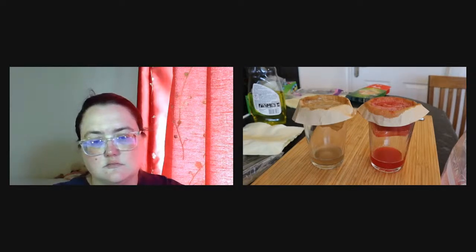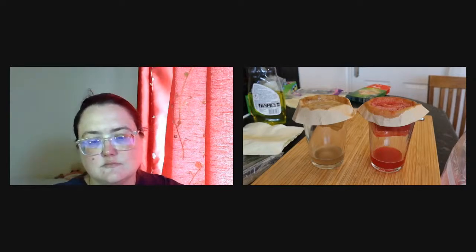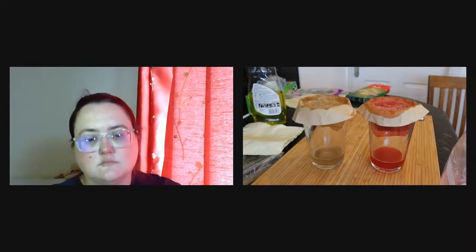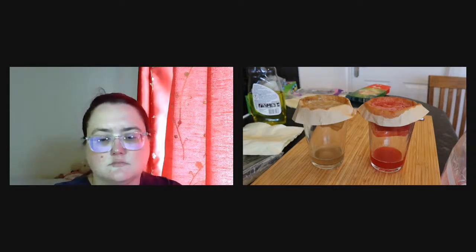I don't want to tell you right away what color the DNA will be. But clearly at this step, we can see that we extract not only DNA, but also other pigments. And the pigments that make the red color, clearly you can see them. And for the banana, you have some yellow and brown pigments that are coming at that phase at the moment.